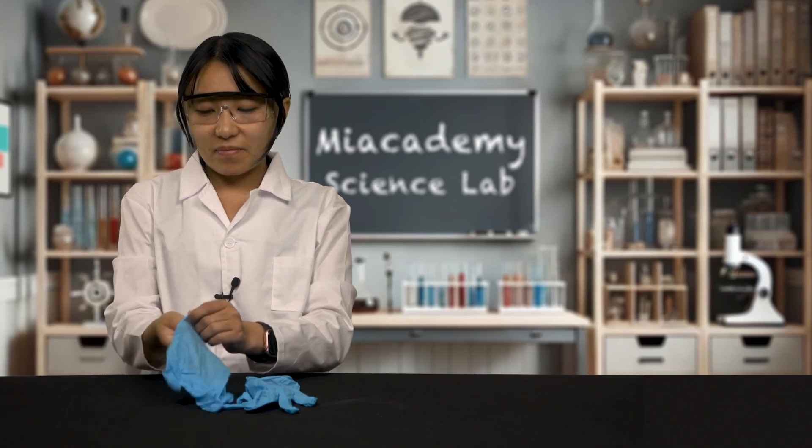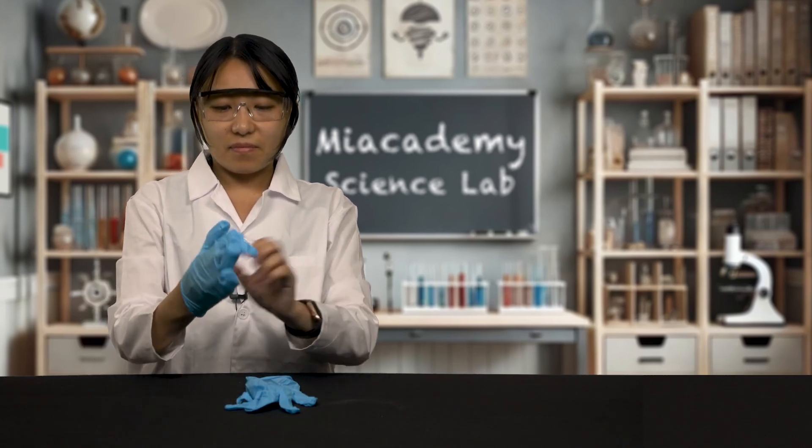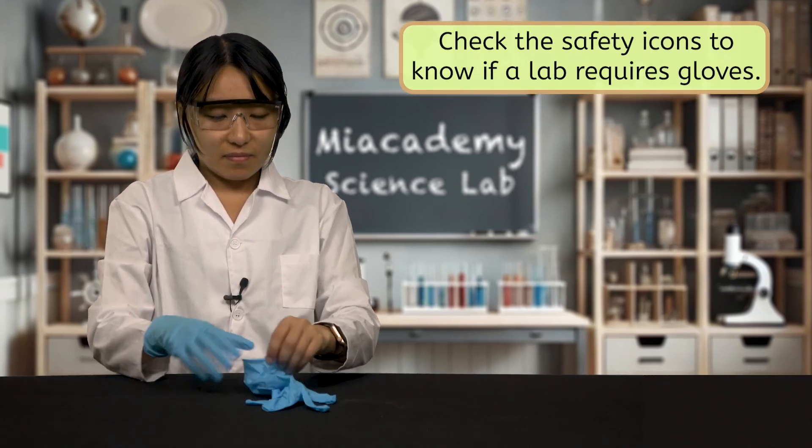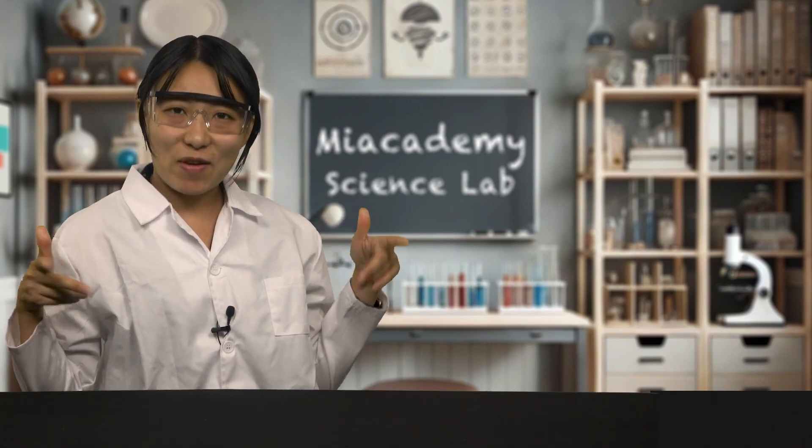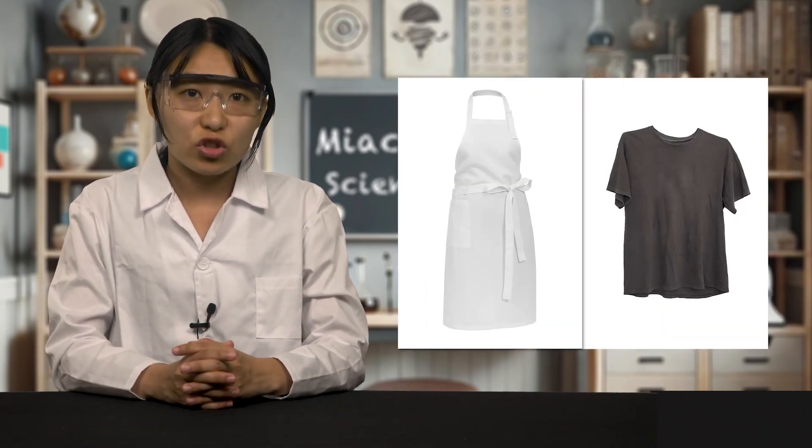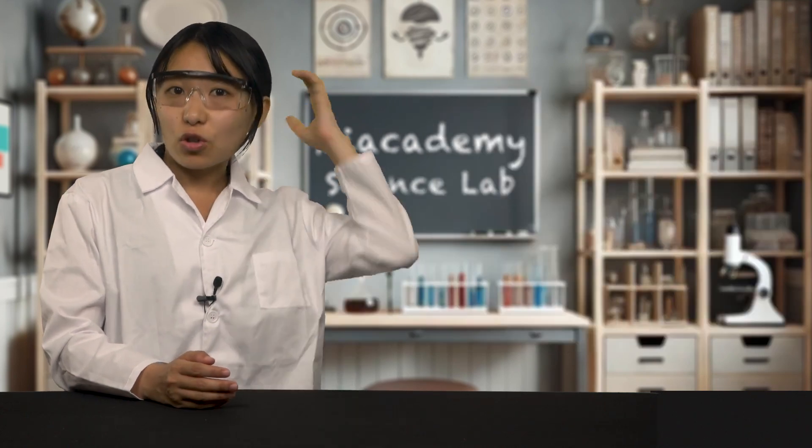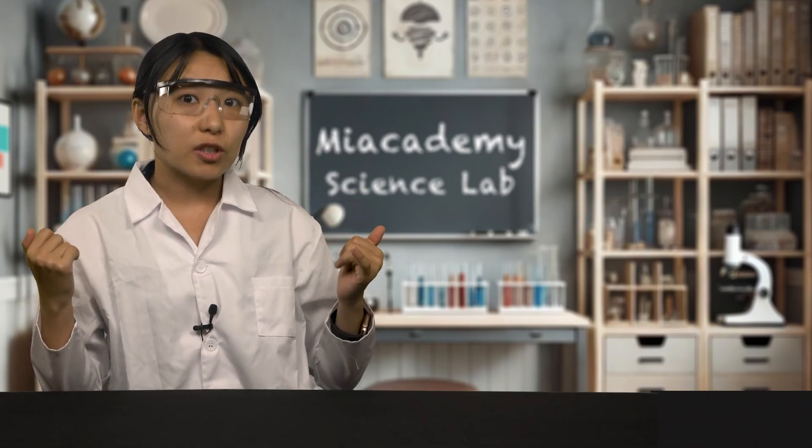Closed-toed shoes protect your feet from any broken glass or spills, and gloves help shield your hands from irritating chemical substances. You won't need gloves for every lab, but always check the safety icons to know for sure. And don't forget your clothes! Trust me, a lab coat isn't just for looking spiffy. It can save your favorite shirt from messy spills. If you don't have a lab coat, an apron or an old t-shirt should do the trick. Finally, make sure to tie back long hair, roll up loose sleeves, and remove any dangly jewelry. You don't want anything getting caught in your lab setup.